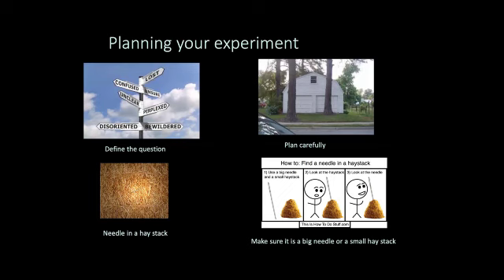But an electron micrograph of a cross-section of a cell can be very, very complicated, and so saying, what does it look like, doesn't really get you very far in analyzing your micrographs. You have to ask a question such as, what does the mitochondria look like? What does the nuclear envelope look like? What does the plasma membrane look like? So be specific when you're defining your question.